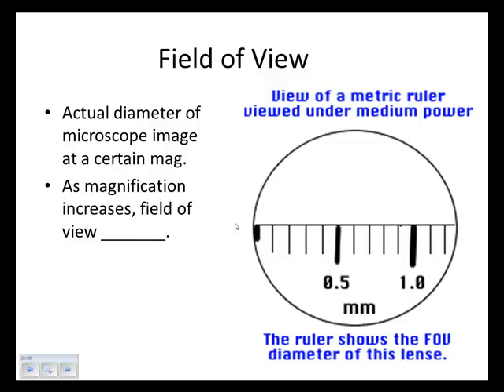So, if you saw an ant right here, you could have a guess, a ballpark figure of how big that ant is, right? Those things you saw, if you knew the size of the field of view under the magnification that you were looking at, the things you saw swimming around, you could give an eyeball estimate of how big they were. Do you agree? Okay. So much for field of view.